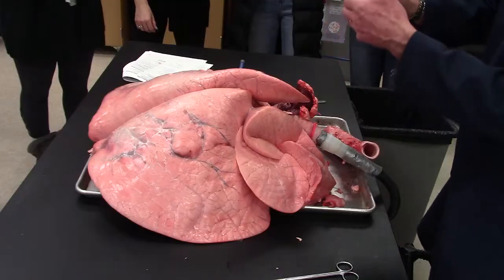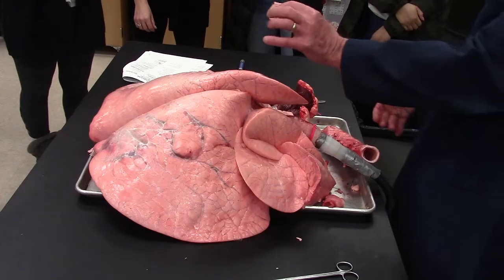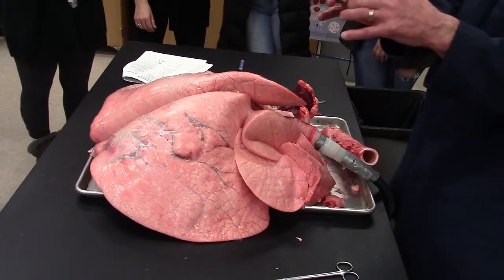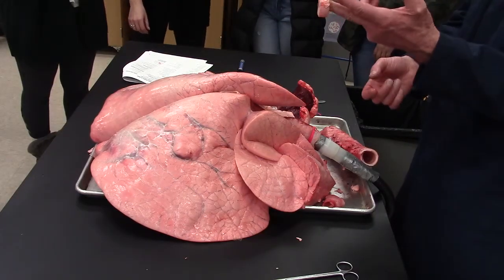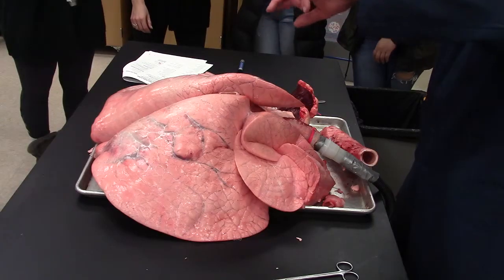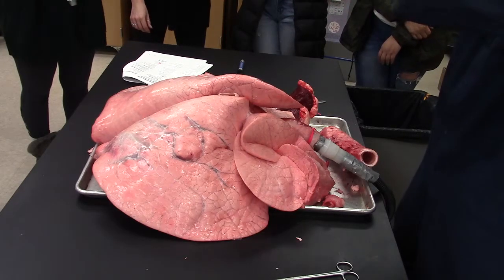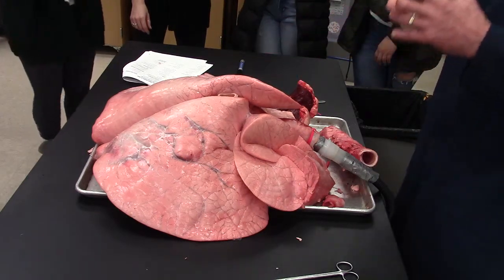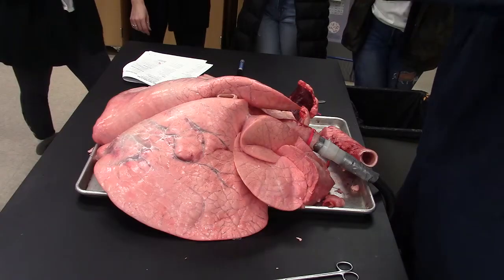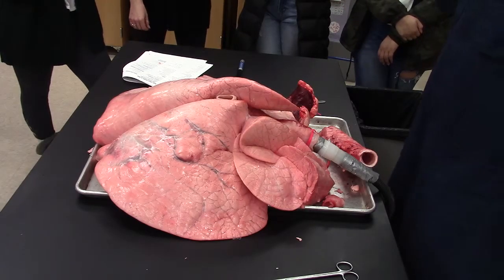This is a piece of the aorta. It's fairly thick-walled. There's very little muscle in this — it's mostly elastic fibers and connective tissue. So watch what happens: it stretches like a rubber band. If I put my fingers through it — that's what happens when the heart contracts. It pushes out a large volume of blood with every heartbeat and squirts it out into the aorta, and the whole aorta expands and swells up.